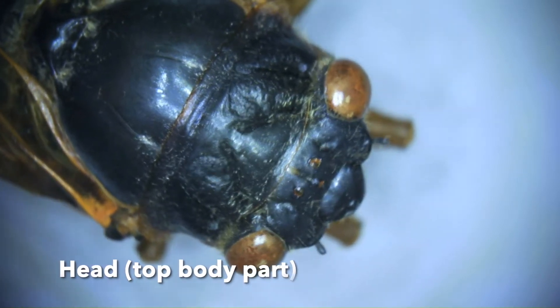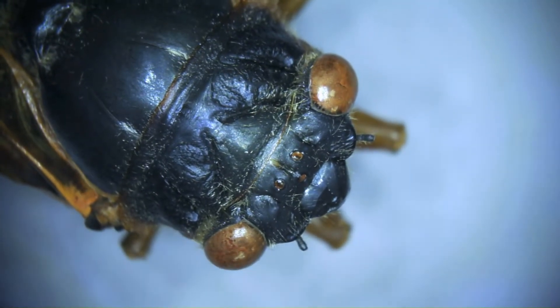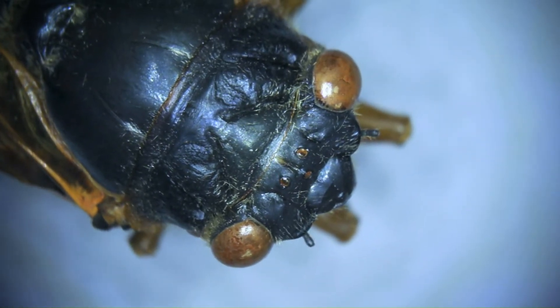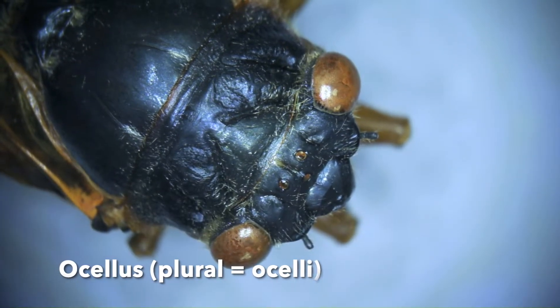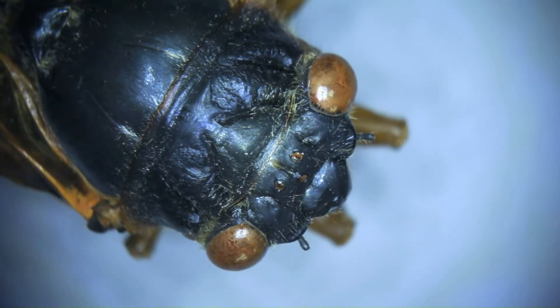But here we're going to examine the head. You can see the eyes and these three dots here kind of in the middle. We've got our eyes, large and bulbous, and then you can see these tiny three amber colored dots — those are the ocelli.